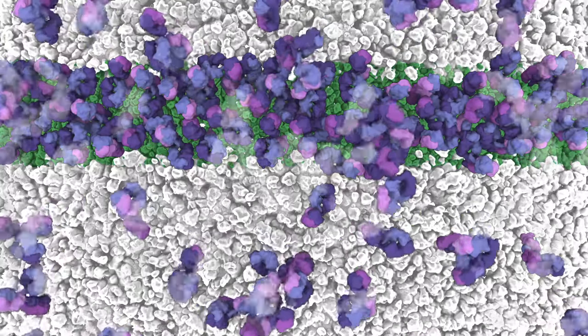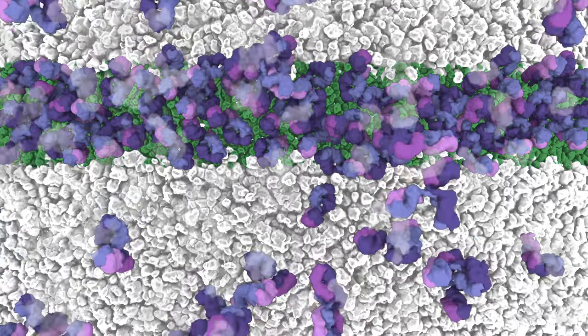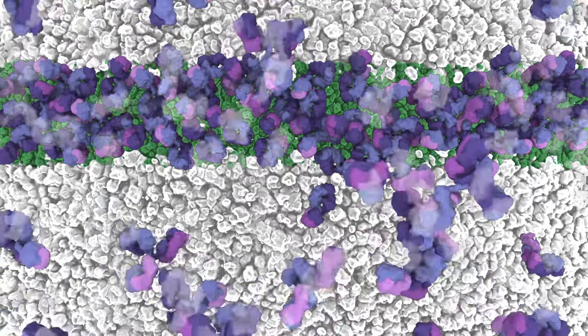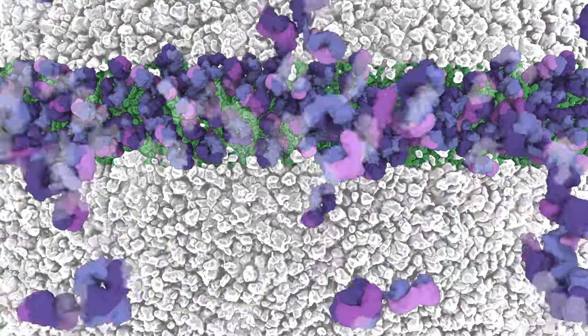Incubation is then followed by a series of washes with washing buffer under mild agitation. Washing buffer contains the same mild detergent used in the blocking solution, which helps remove nonspecifically bound primary antibody.